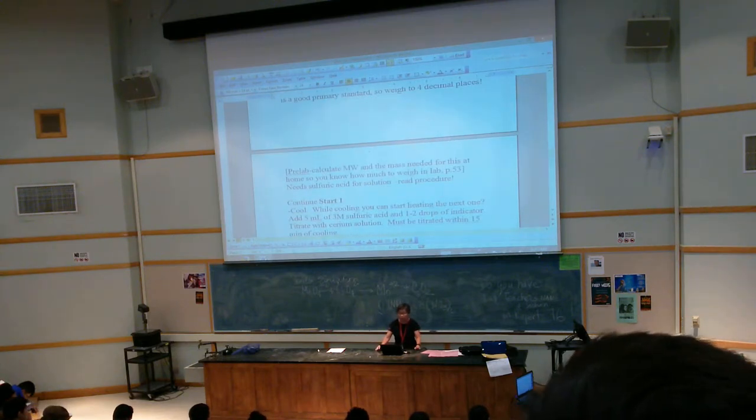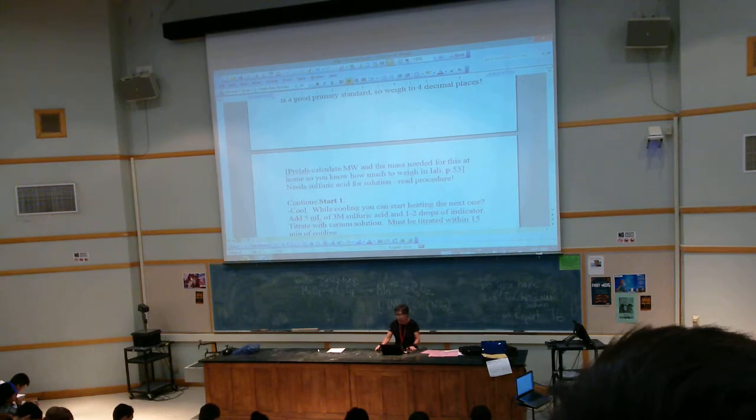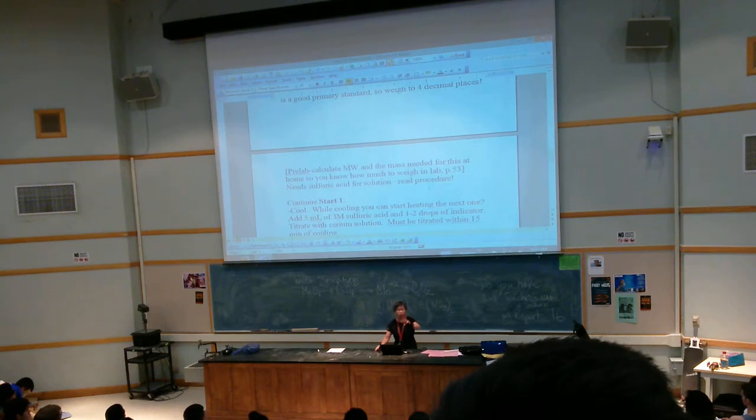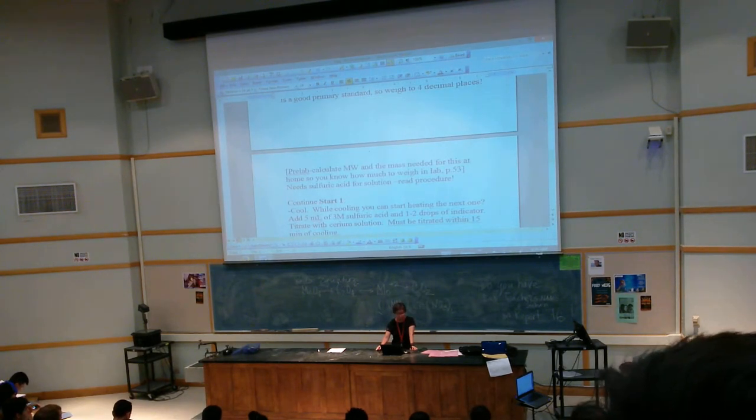Okay. So look at the procedure, okay? It's on, I think, page 53 of your manual, that is where the pre-lab requires you, but I have an old manual, so it might be off a few pages. So after you've done the cooking, I'm going back to start one, okay? Because those are the two you can start first. After you've done the cooking, you will cool it. While cooling, you can start heating the next one.